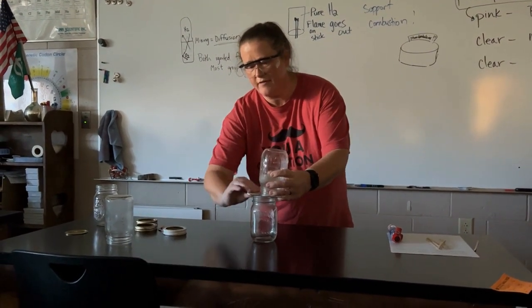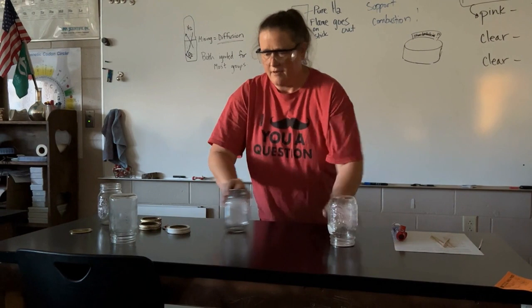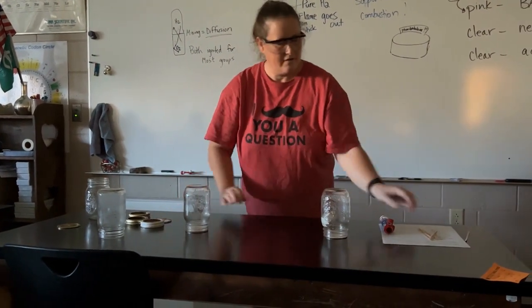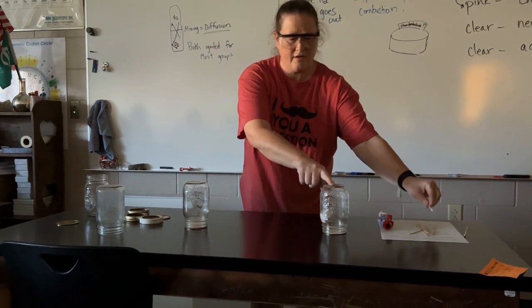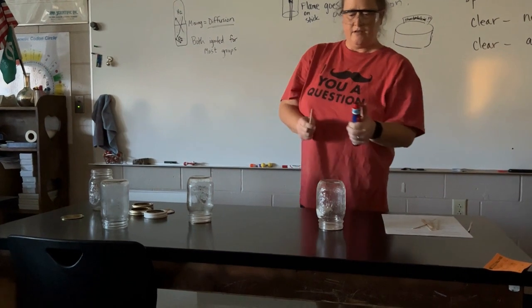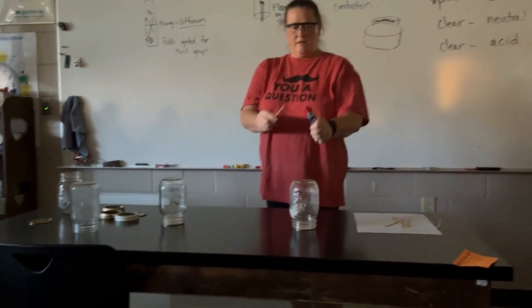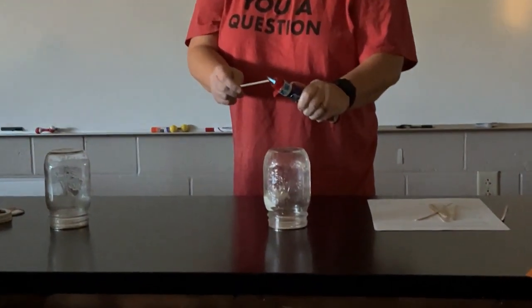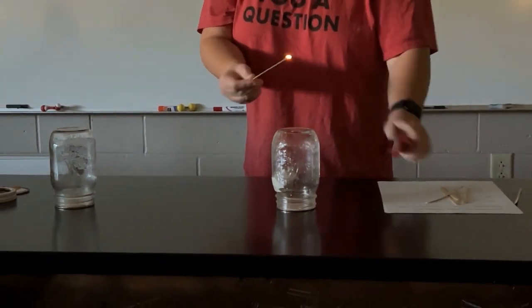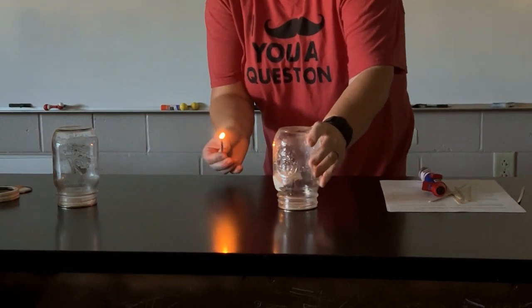So I'm going to seal them off from each other. Was this the top one? This was the hydrogen originally, this was the oxygen. So let us try to ignite the one that had the hydrogen in it. We didn't warn the neighbors.